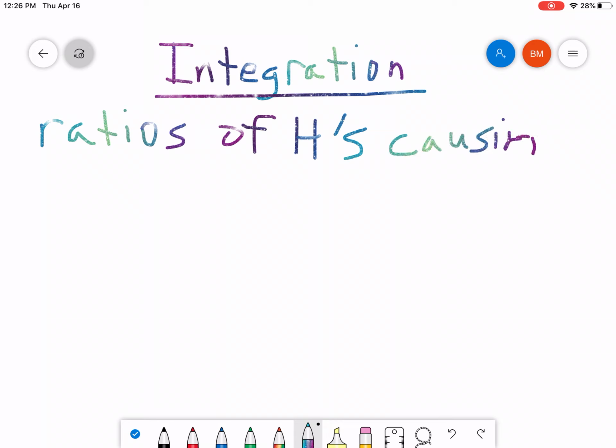Now you can breathe a sigh of relief here because you don't actually have to calculate the area underneath the curve. The machine does that for you. The NMR spectrometer and the software does it for you. What we have to do is be able to interpret it. And like I said, we're going to be using this to determine ratios.